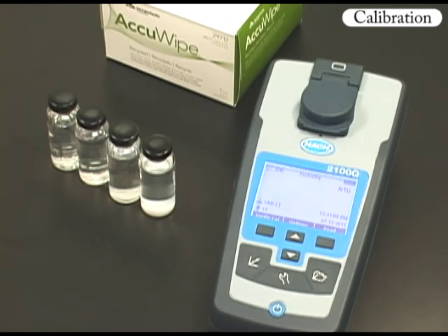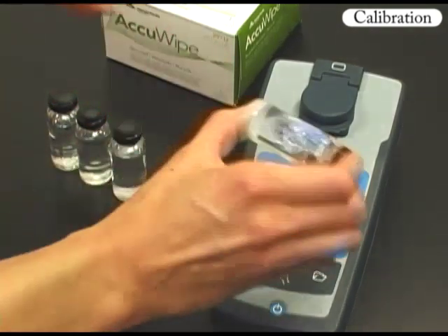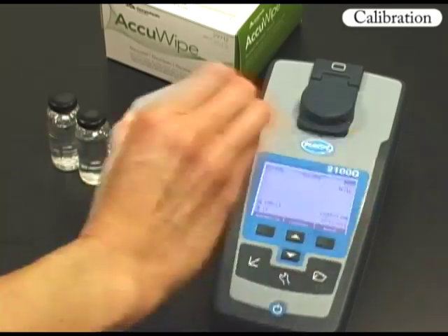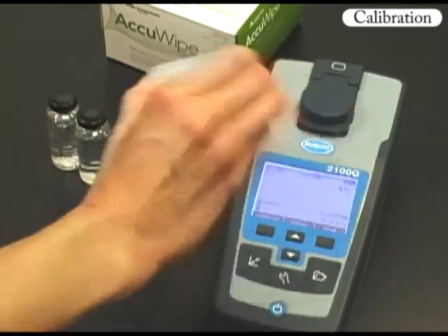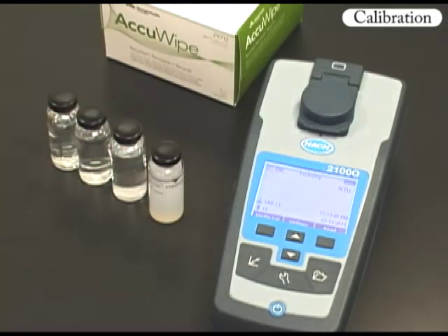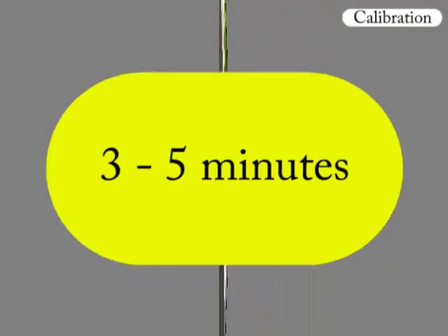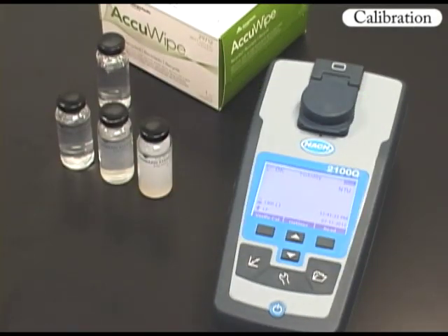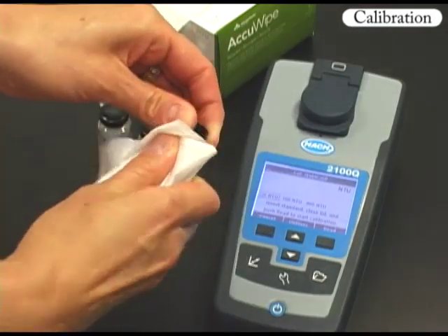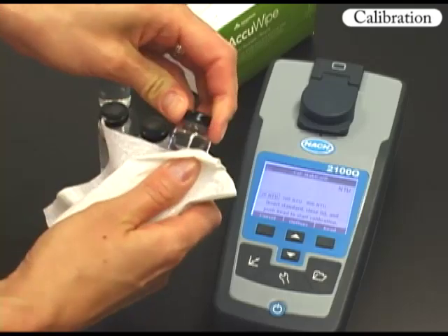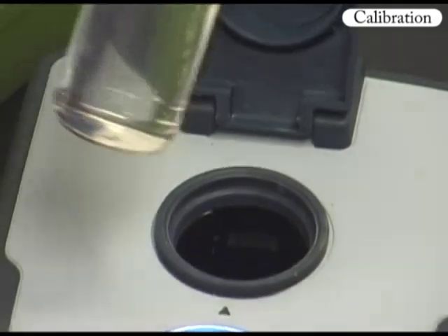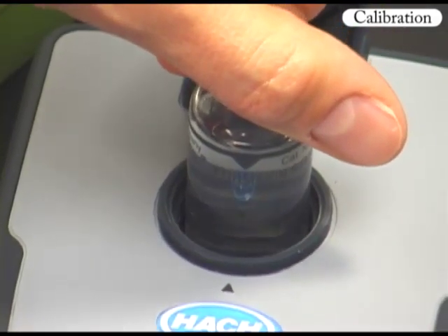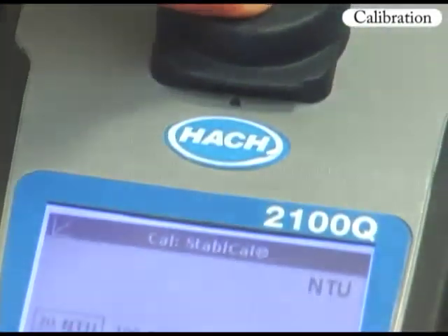Before calibration, prepare all four StableCal standards by shaking vigorously for about 10 seconds. It is very important that you let the shaken standard sit undisturbed for three to five minutes before use, to allow air bubbles to dissipate, which can interfere with the measurement. For measurement of samples above 1 NTU, it is not necessary to prepare the calibration vials with silicone oil. Press the calibration key and follow the instructions on the display. The instrument will guide you through the three-point calibration procedure. Carefully wipe each standard with a clean, lint-free cloth before inserting into the instrument, being careful not to touch the glass with your fingers. Insert the sample cell with the orientation mark aligned with the orientation mark in front of the cell compartment. Close the lid and press Read.